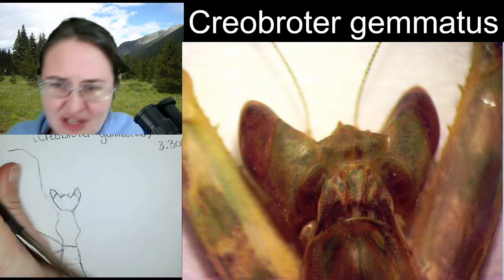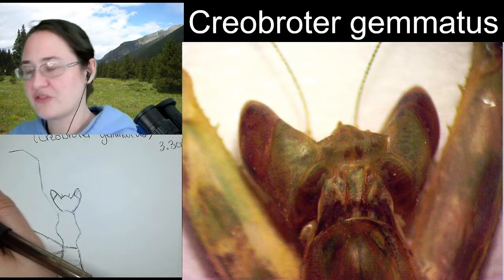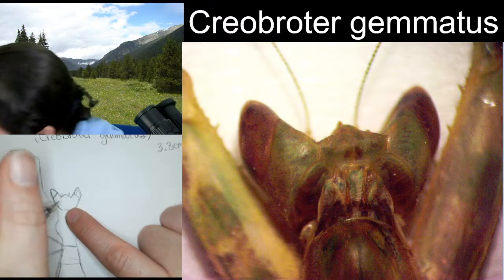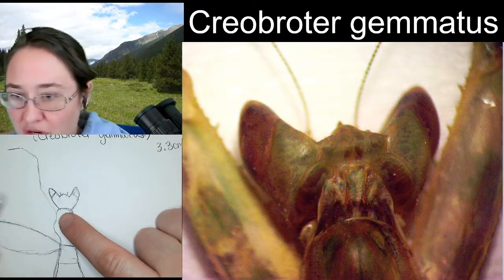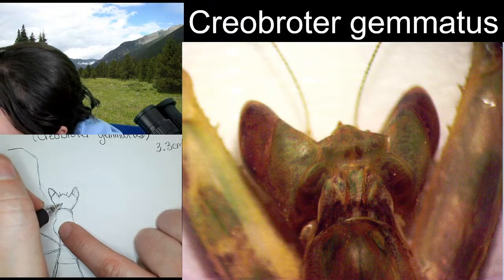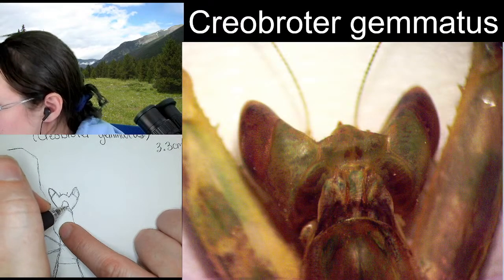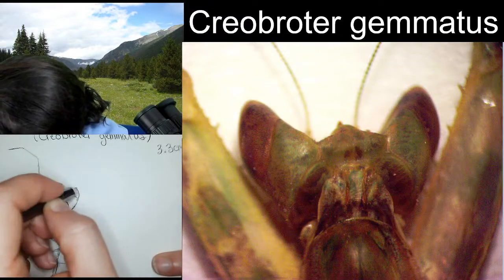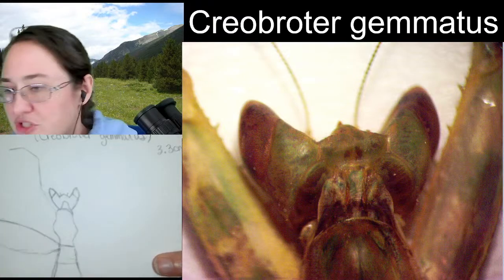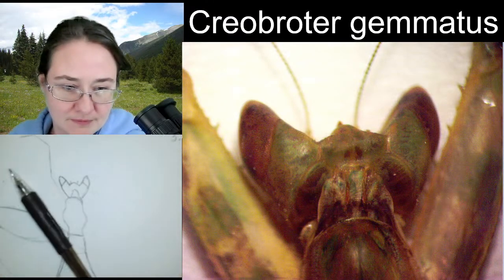So there is also this kind of neck-like region that connects to the back of the head here. So we have the connection where we know the pronotum is going to be connected, but there is one additional kind of neck integument here that's going to be connecting to the head. So I'll make sure I get that in. We'll add the antenna once we add the legs so that we know how long they're going to be.